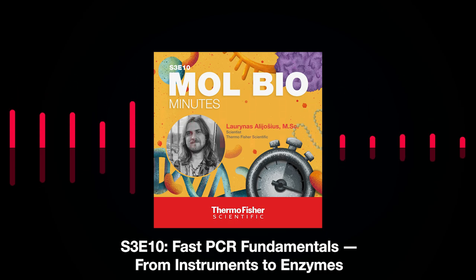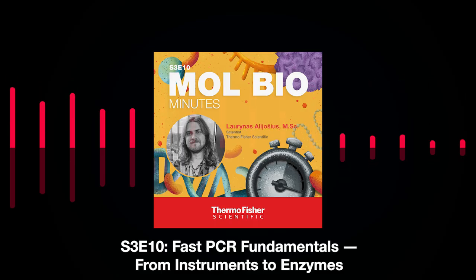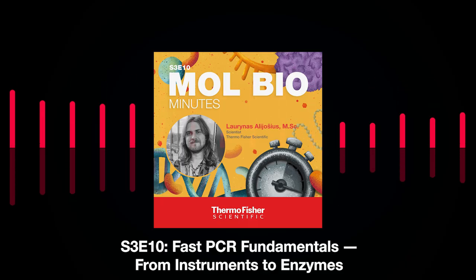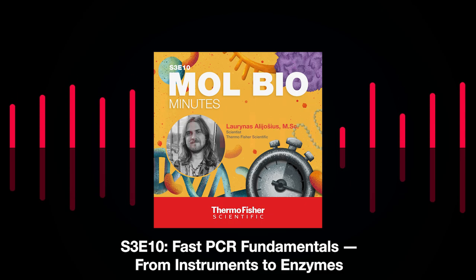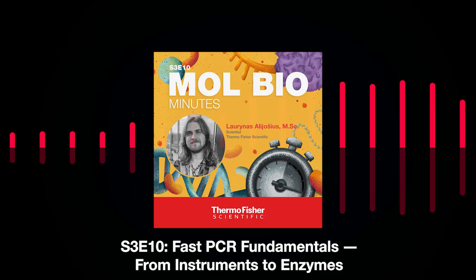Okay, so we know about the benefits a little bit, but how do we do fast PCR? Let's break it down here. First up, let's talk about your PCR instrument. For fast PCR, you want to have a fast ramp speed, optimally from, let's say, 4 to 6 degrees per second. And some instruments have even faster ramp speeds. But it's important to keep in mind that if you want to use very fast ramp speeds, it's good to test them out and optimize and see what kind of products are forming. Is the PCR going successfully?